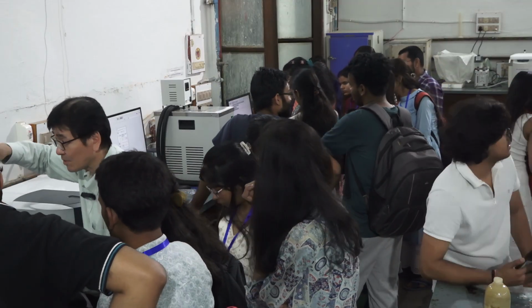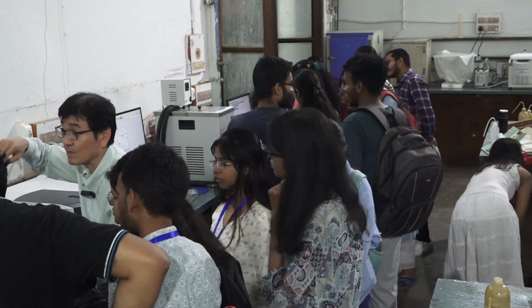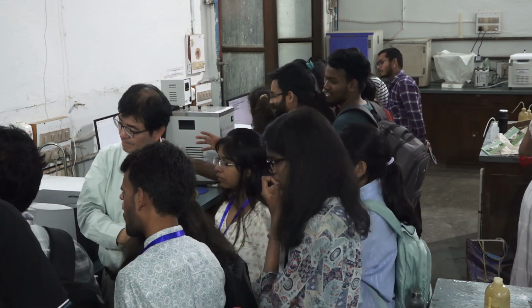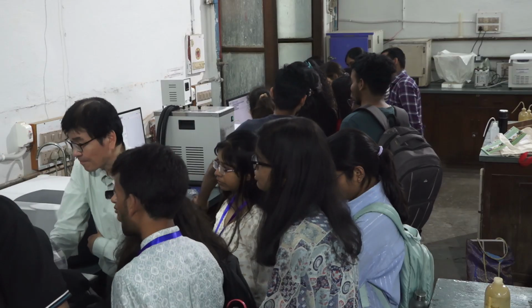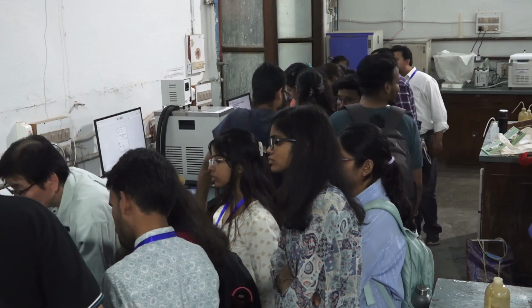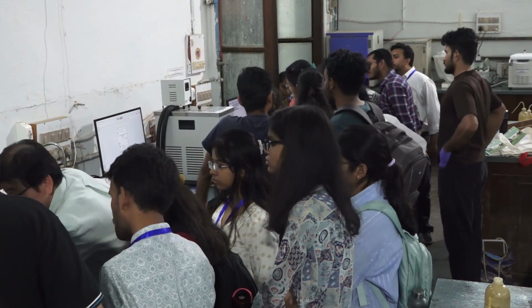In order to identify which is the solvent peak, we need to measure the solvent spectrum. Then put the sample here. Okay, let's try this glucose.